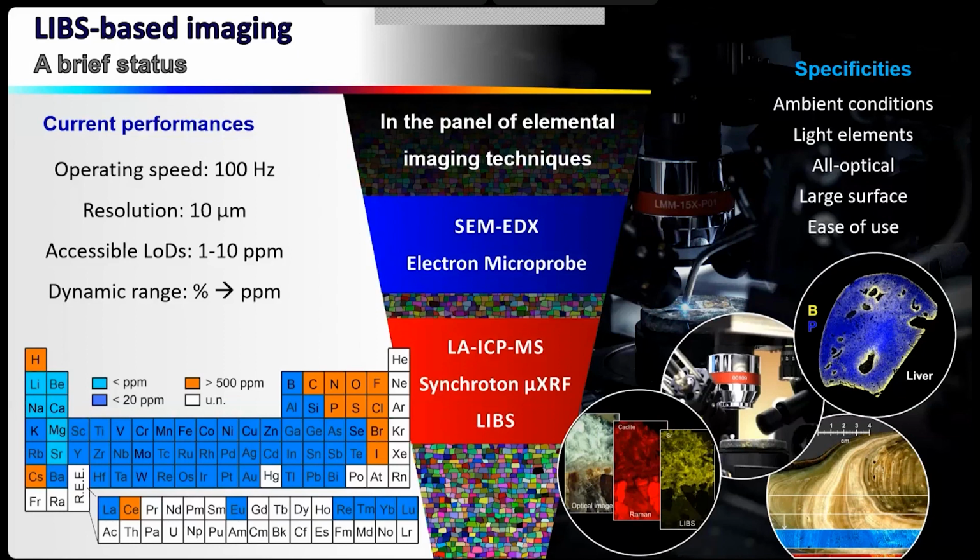Like I say, it's an optical technique, very easy to combine with Raman, optical, fluorescence imaging. Since we are in ambient atmosphere, it is much cheaper, much easier to use, and you can scan very large surfaces also. It's not a big deal with that.